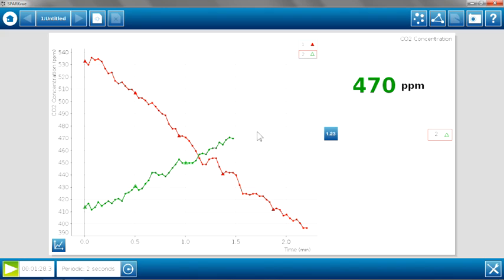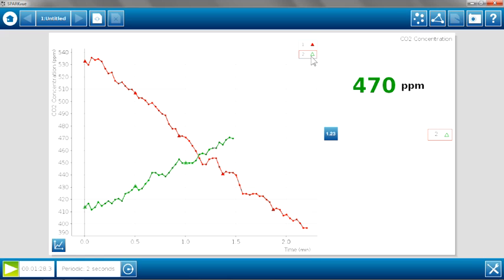So my two runs you can see are two different colors and there's also different symbols associated with those, and you can see a key of those symbols in this area here. Right now the run two with the green triangle has a rectangular red box around it, so that means that that run is the run that's currently selected and if I choose my analysis, my graph analysis tools, that will be the line that is analyzed. I'm going to go ahead and go back to run one and analyze that one first. To do that, I'm just going to click on the key for the runs and I'm going to click on the symbol for run one. And you'll see that moves the rectangle to being around run one, so that's going to allow me to do the analysis with that run.